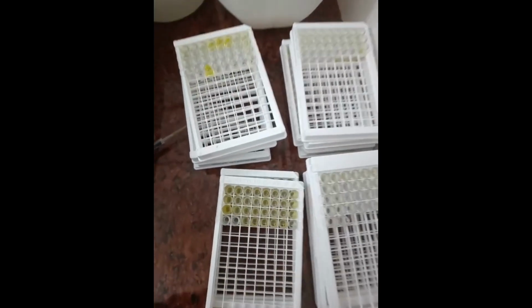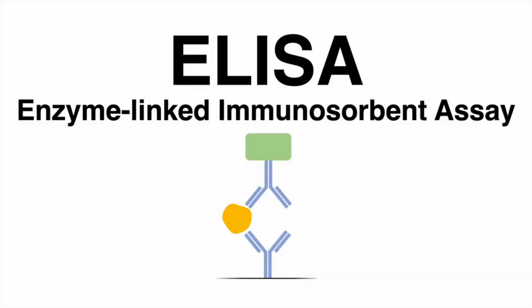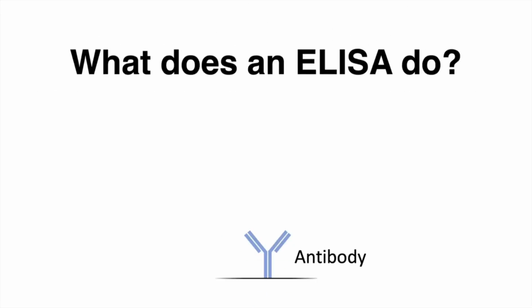Now, what is the principle? ELISA is based on antigen-antibody reaction. So this is important. ELISA is based on antigen-antibody interaction, which represents the chemical interaction between antibodies produced by B cells of lymphocytes and antigens. The specific immune system produces an immune response in protecting the body from invaders such as pathogens and toxins. Hereby exploiting this reaction, ELISA permits highly sensitive quantitative and qualitative analysis of the antigens.